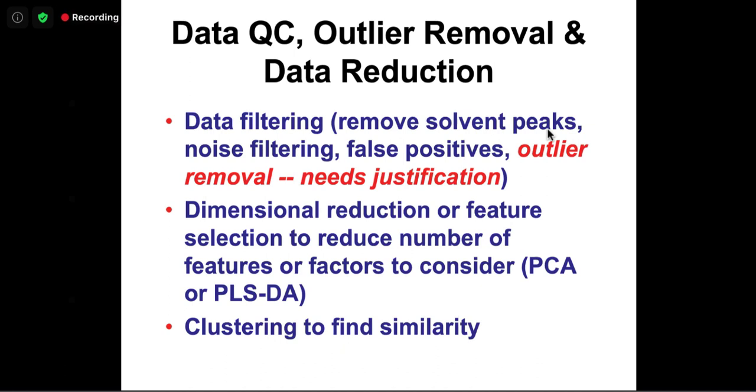And some features have a clear, very good, beautiful signal, well mirrored, but that's not a change. So that's not consistent with biomarkers or related to your biological process. So things that do not contain too much information, you can think about removing them.